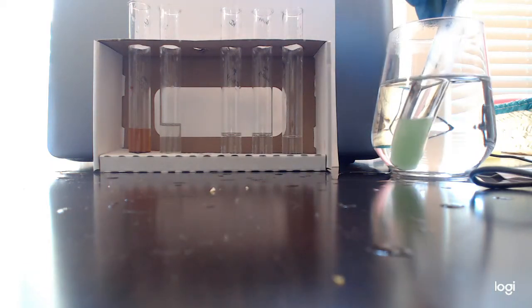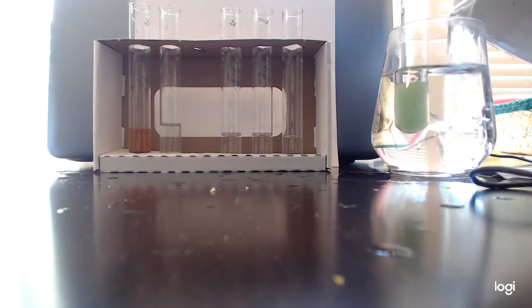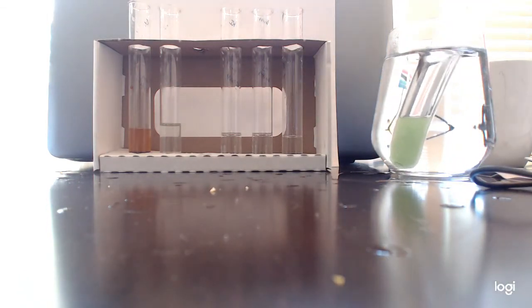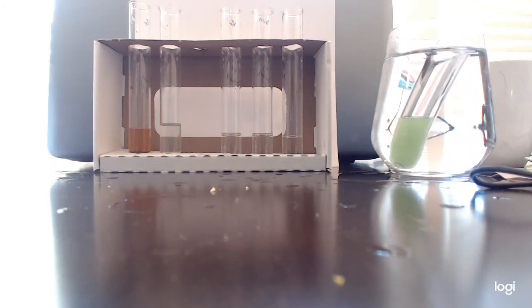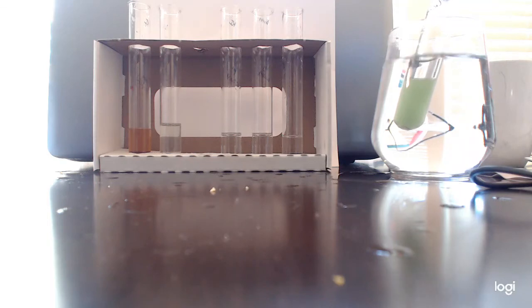Now you can see it's already changed color. It's kind of this Ghostbusters Slimer green color, if you've ever seen that movie. I'll put even hotter water in, and that will help the color change even more. Look how neon green this is, y'all. I mean, this is full-on Ghostbusters Slimer in the first Ghostbusters color.